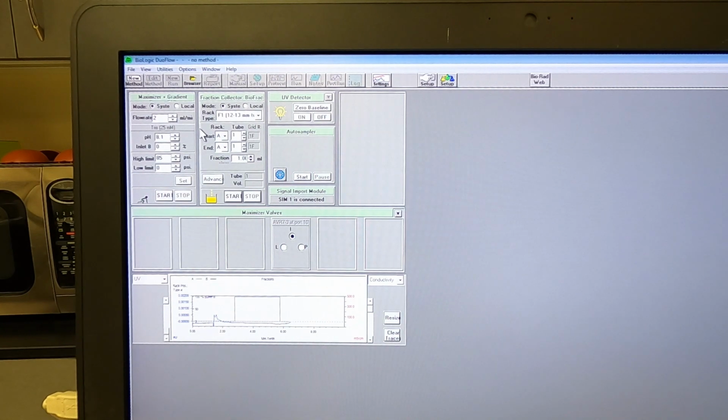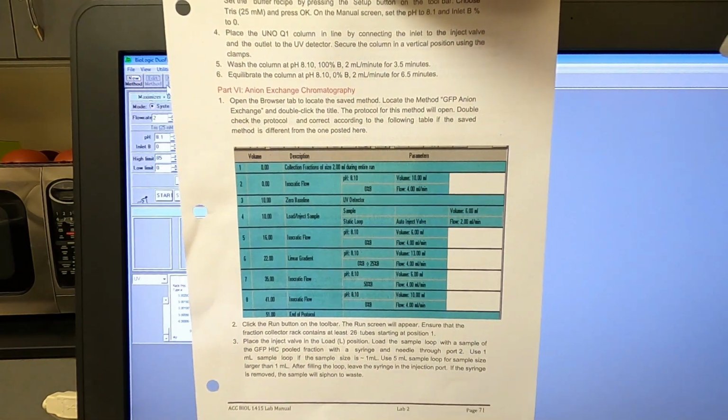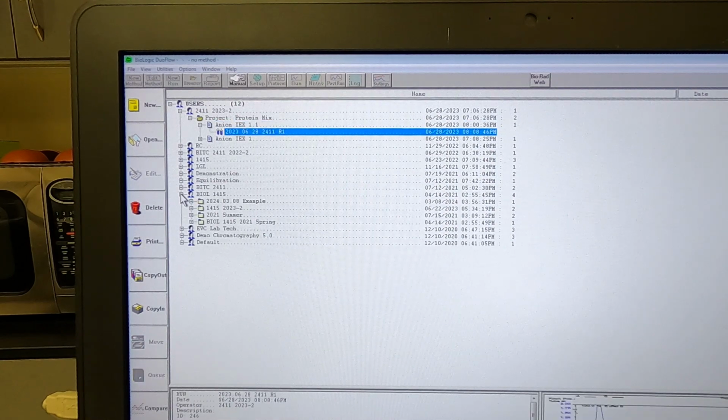Okay, here I'm going to show you how to build the purification method. We're going to use this one here. So again, here's our browser menu. We can see we have our users, and then each user will have project folders, and within each project you will have purification methods, so anion exchange, and then each method will have several runs. So this is our folder.